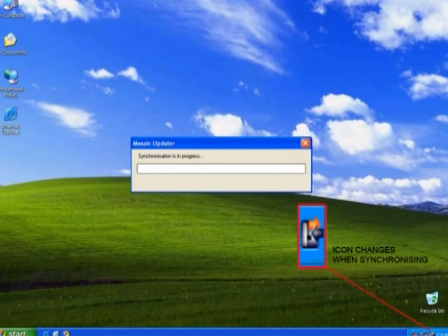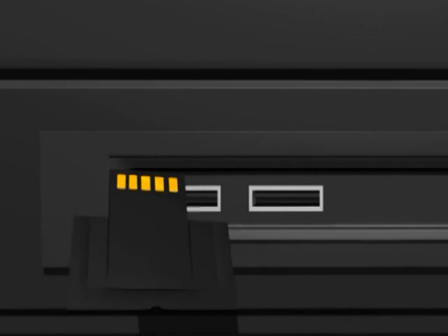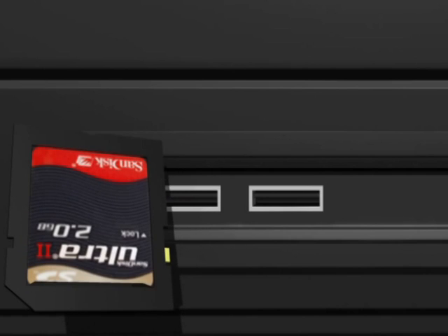A dialog box will appear on the computer screen. Synchronization describes the process where any updates for the instrument are downloaded to the SD card and test results and instrument data are uploaded to the Mosaic server. When synchronization is completed, remove the SD card from the USB port of the computer.